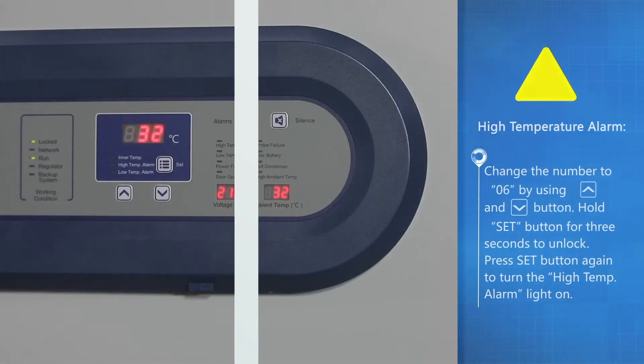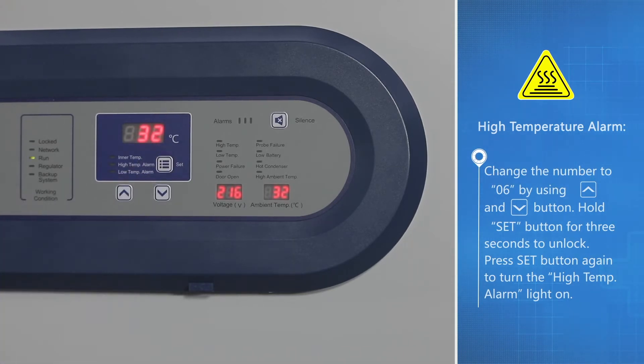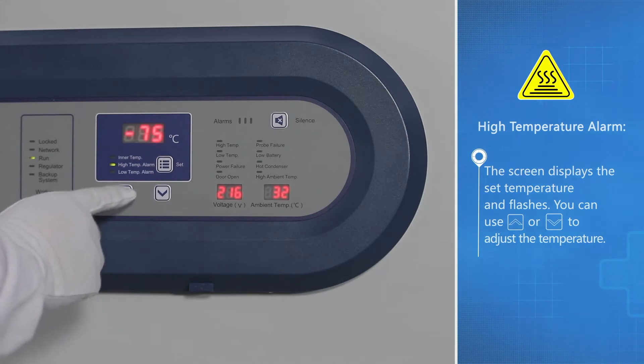High-temperature alarm: change the number to 06 by using the up button and down button. Hold the set button for three seconds to unlock. Press the set button again to turn the high temp alarm light on; the screen displays the set temperature.